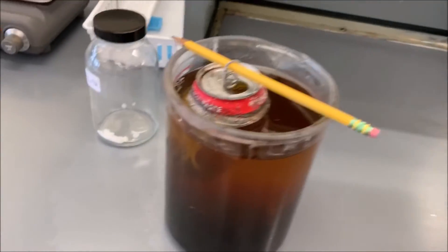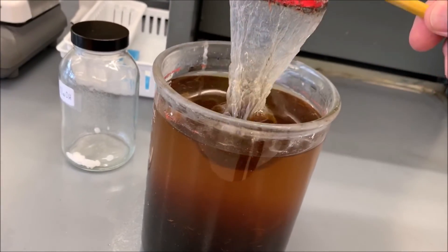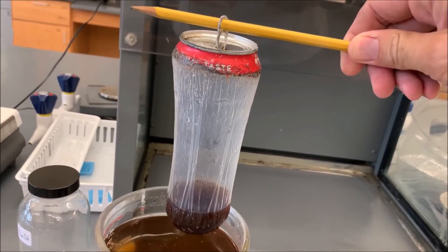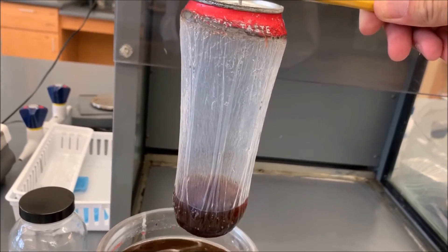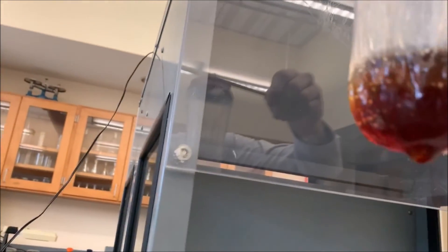I've let the aluminum can sit in the sodium hydroxide solution overnight, and it looks like it must have developed a hole because most of the Coca-Cola has drained out. But you can see that plastic lining that's been sprayed on the inside — it's completely transparent and visible. The top is still present, and notice the bottom has completely reacted at this point.